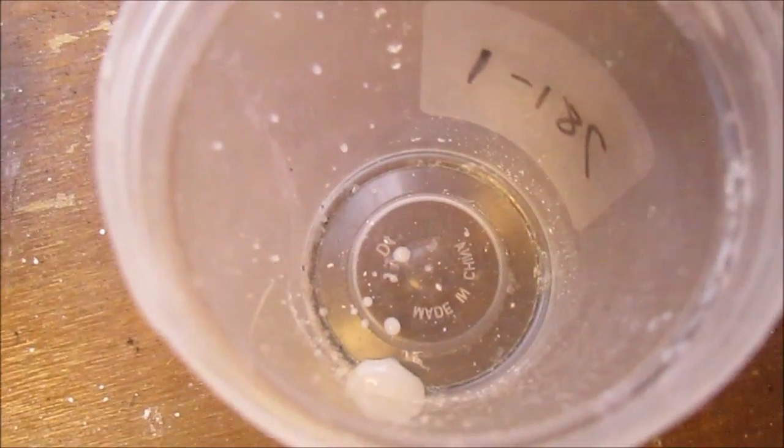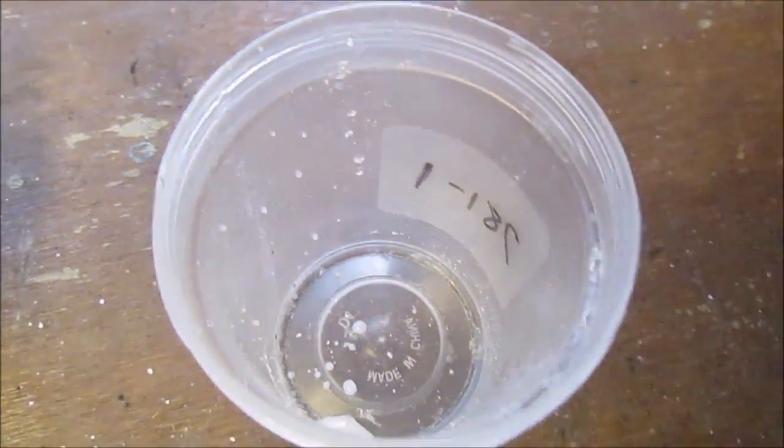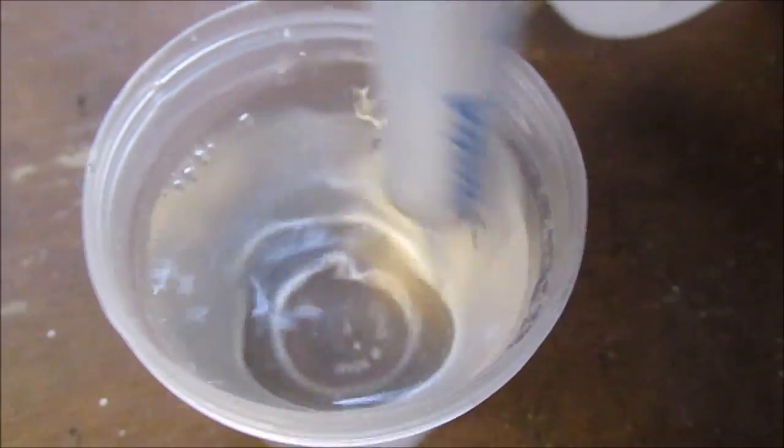Now we add in our sodium hydroxide. I've got a little bit of sodium hydroxide in there, and now I'm just going to add in the water. Stir that in.